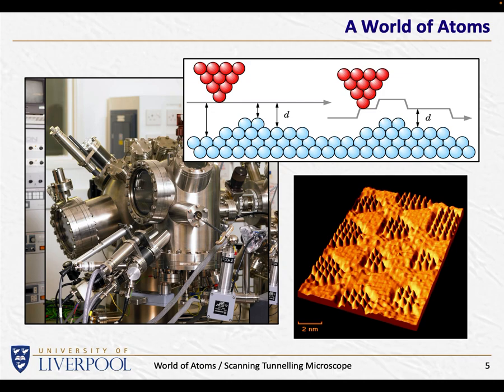This is taken by a colleague at the University of Manchester, and this is the surface of rust. And we're looking here at individual atoms, these sort of pyramids. The scale has been exaggerated a little bit to make them a little more prominent, but these pyramids that you can see in these islands here are individual atoms. And clearly they're not uniformly spread over the surface, they are clustered together in little islands.